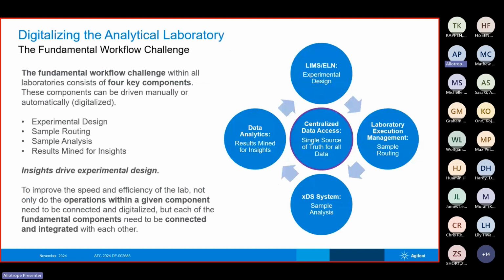I would like to touch upon digitization and the way we see it. Sometime last year, when I was speaking to customers, before all the OpenAI hype, a lot of our customers were saying that when we speak about digitization, the first step is to stop all paper operations in the lab. We are going to be migrating to some kind of an ELN, a LIMS, etc. And they say they will deal with this by coming up with the way we design our experiments or schedule our experiments, then how we put all of these experiments into different instruments, and how we do the analysis, and finally how we mine these experiments for data.